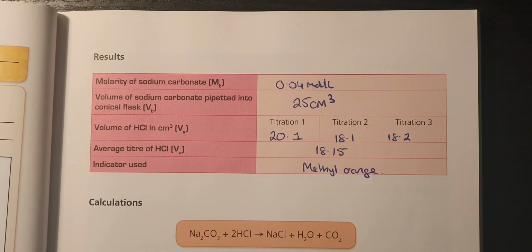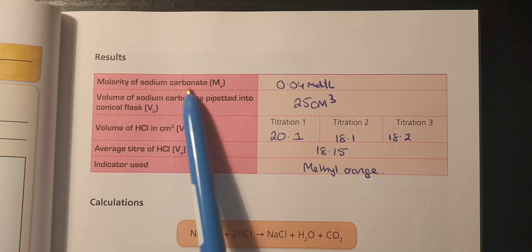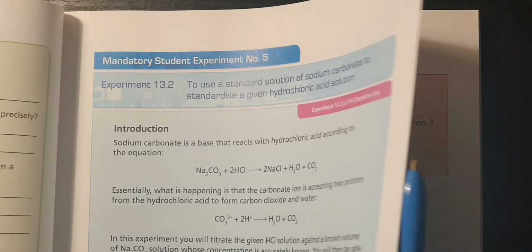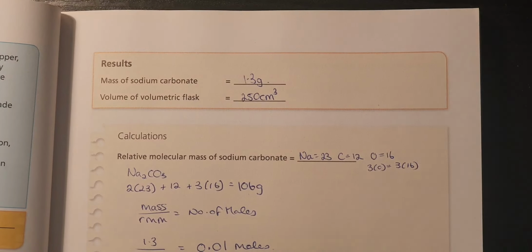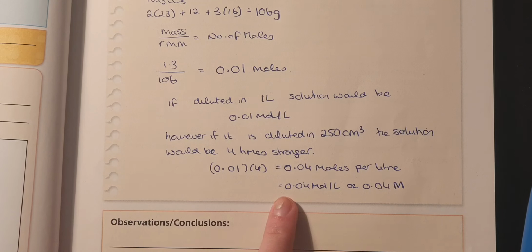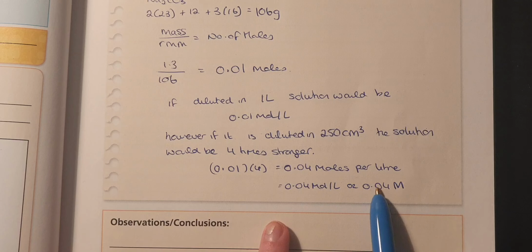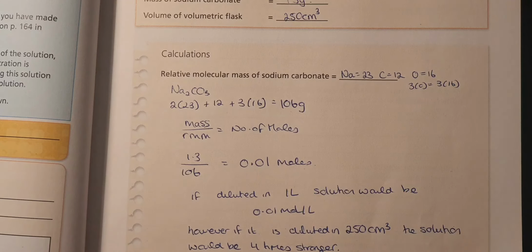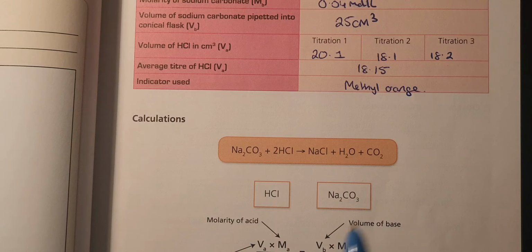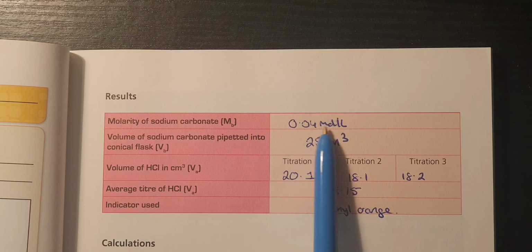So then we should go to here in our calculations, and now we've filled in the molarity of the sodium carbonate. We've gotten that molarity from our previous experiment. So if you flick back a few pages, you should have worked out the concentration of the sodium carbonate, and this is it here. Now your numbers might be slightly different depending on the weight that you weighed out. Okay, so you're returning back to get the molarity of the sodium carbonate for this section here.